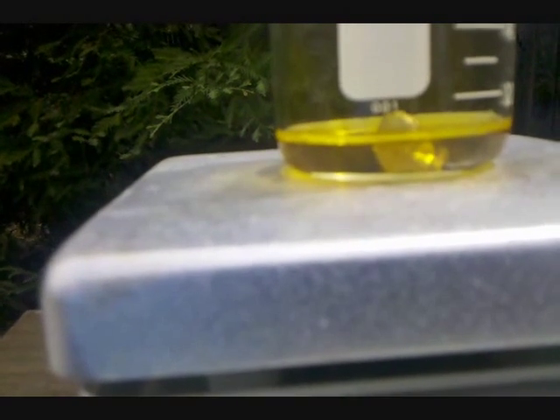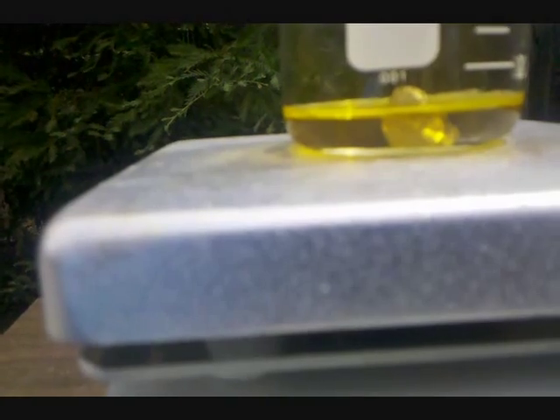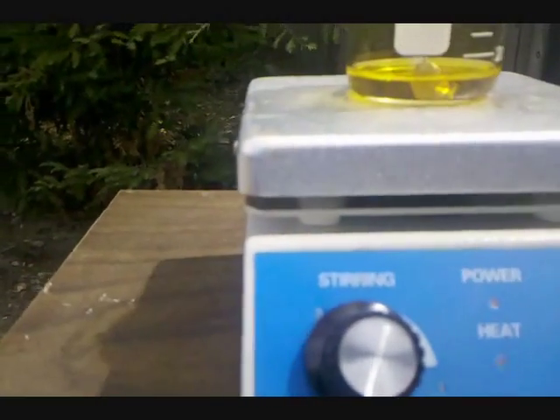So in the beaker right there, I've got my concentrated Nitric Acid and a shot of Bismuth, and no reaction is observed. Which means I'm going to need to be heating it, so that's what's on the hot plate.